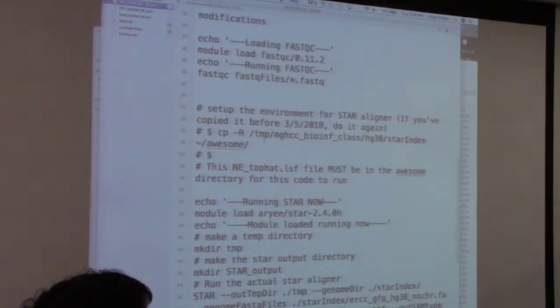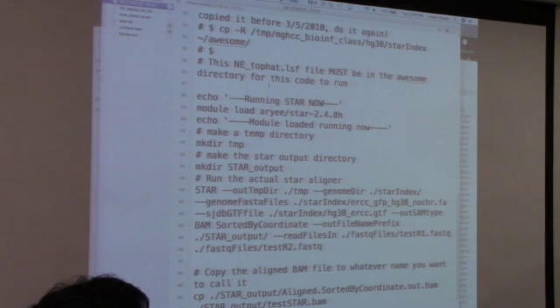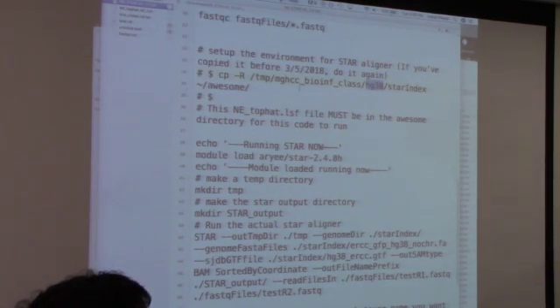So this is kind of like the actual solution for the entire thing. Do you know what I mean? This even tells you to copy this folder there. But because you're copying this entire thing, you don't need to copy anything else, all right? So when you download this, this has the solution for the entire assignment.